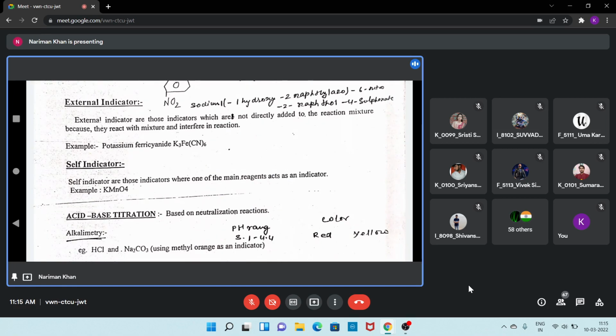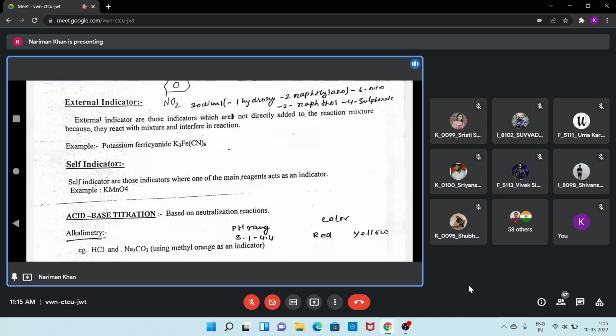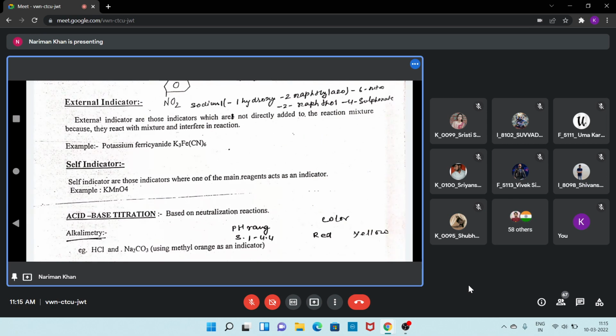You might have seen the box of watercolor. All of you have seen? Yes, ma'am. A grooved tile is similar to the watercolor box. When we remove all the colors, what is there? Only grooves, only compartments are there. Yes, ma'am. So a grooved tile is just like that, a tile with small grooves.